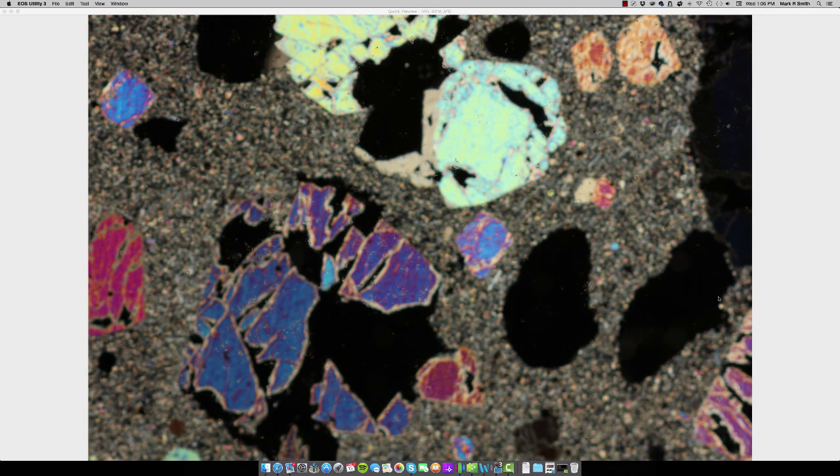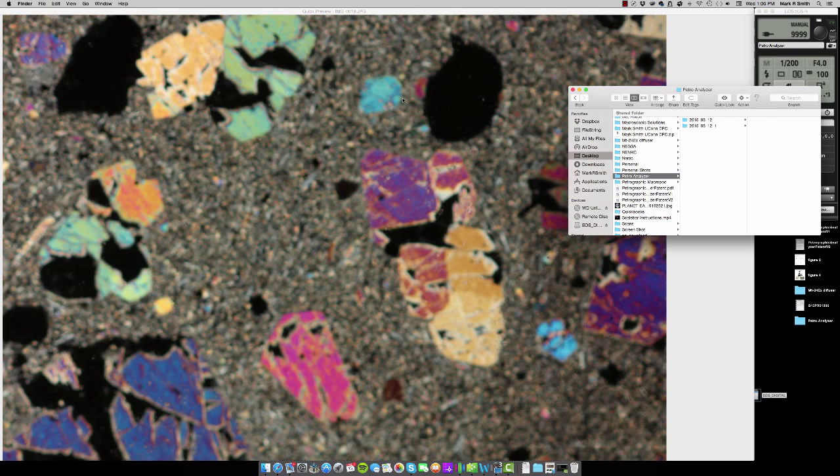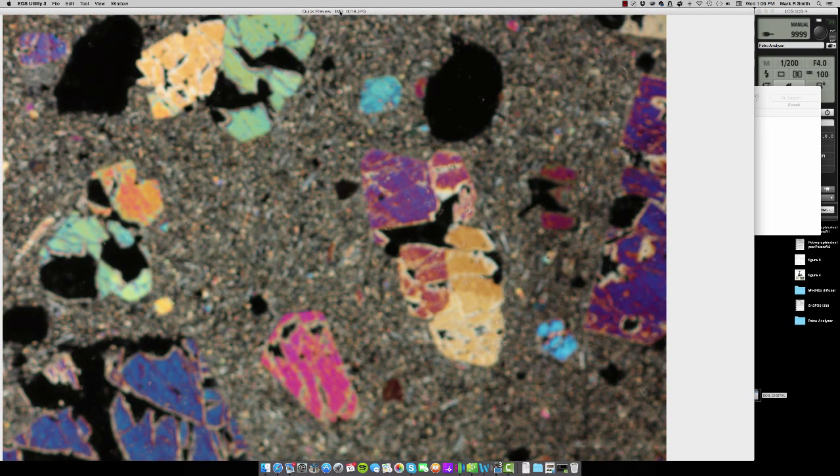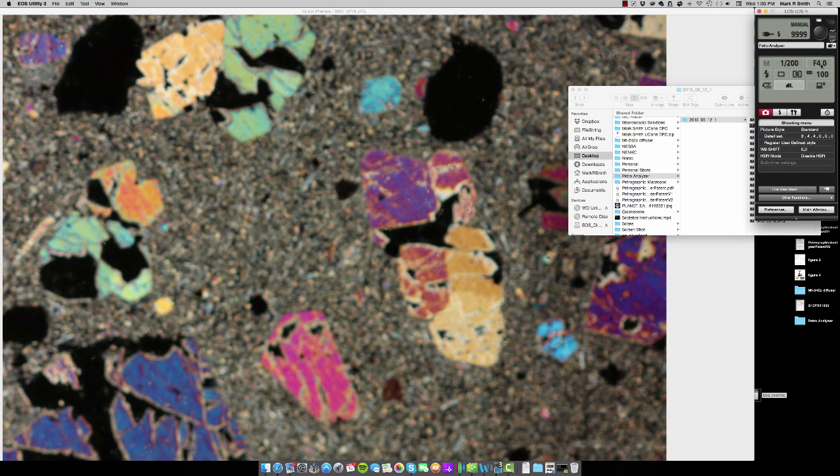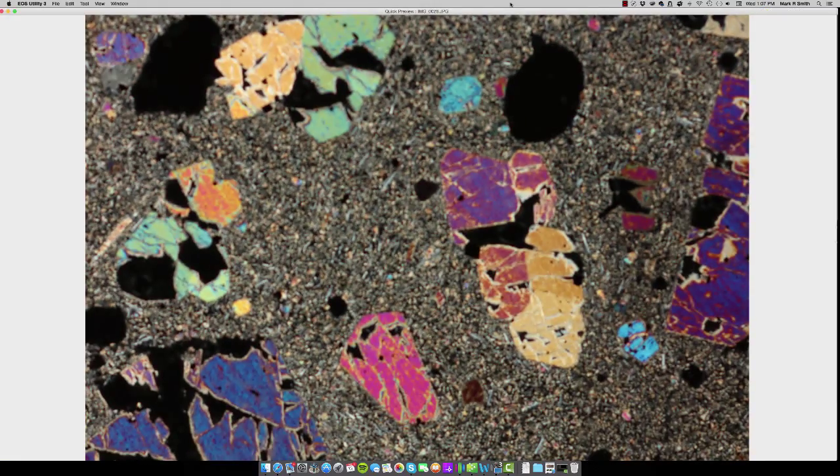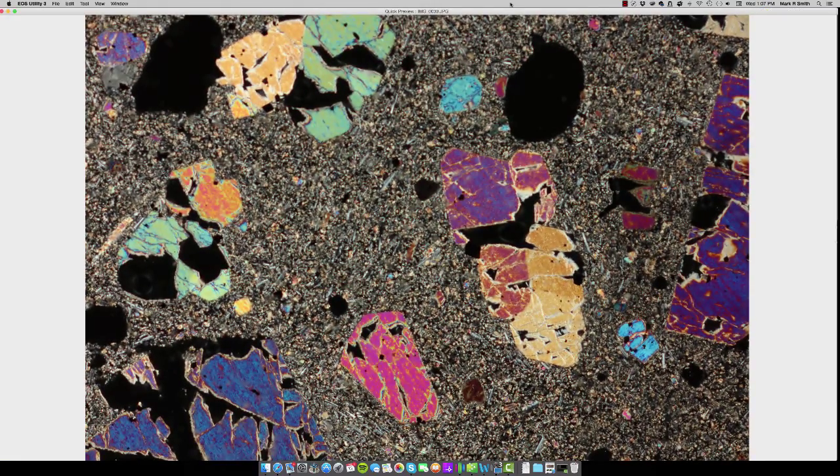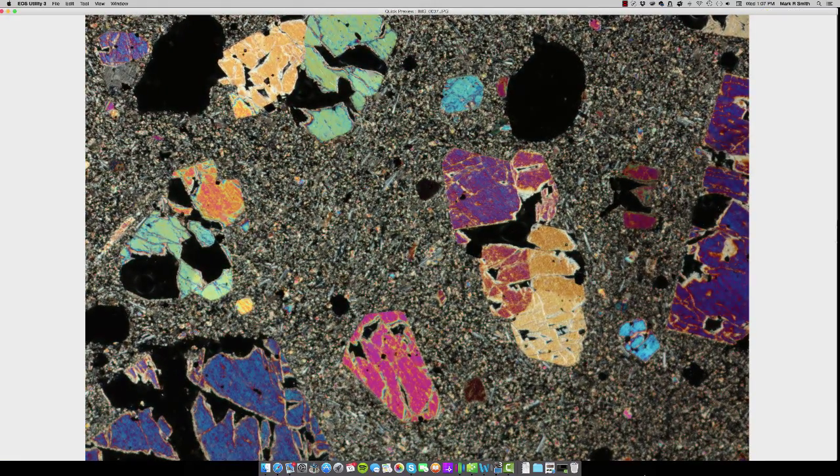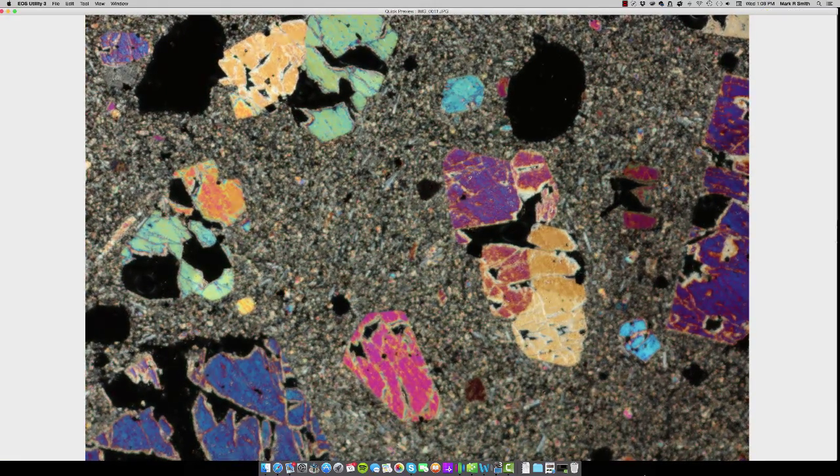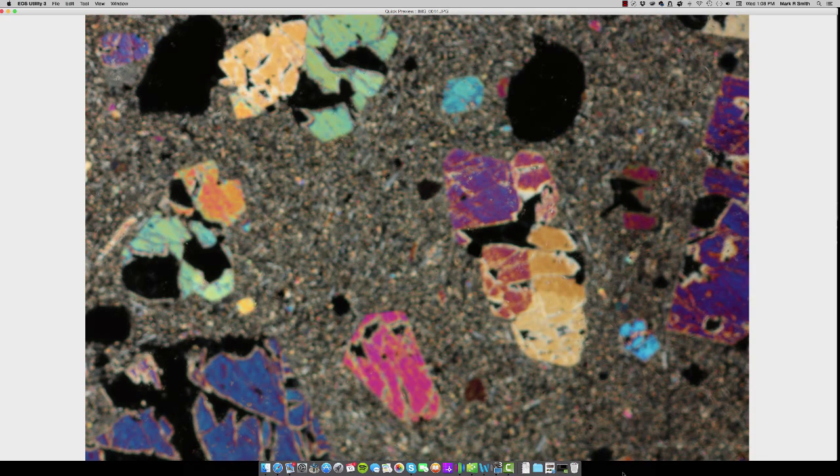Once I have those parameters set, what I'll do is I'll open up a quick preview function and I'm going to go through and I'm going to capture all of these images in a designated folder, which I'm going to select. Now I'm going to go ahead and I'm going to capture 25 images through the sample so you can see the focal plane moving.